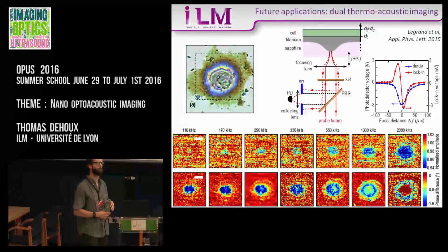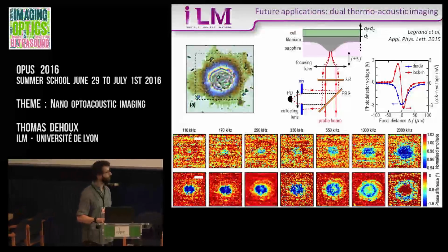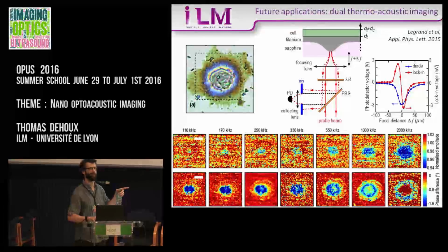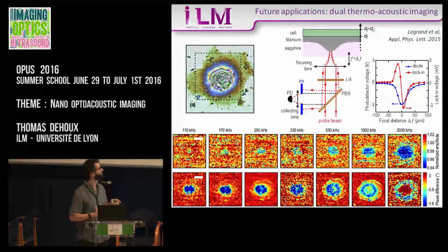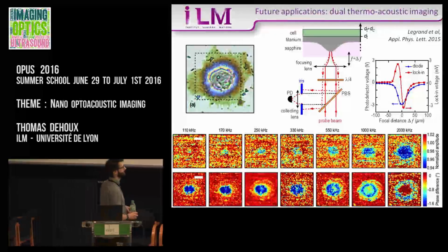Because I was looking at the figure of... come back. Back in which direction? The last slide. Ah, the last one? Yes. On the top right side, the blue curve is the output of the photodetector, right? Yes. And the red one is the derivative of that one?